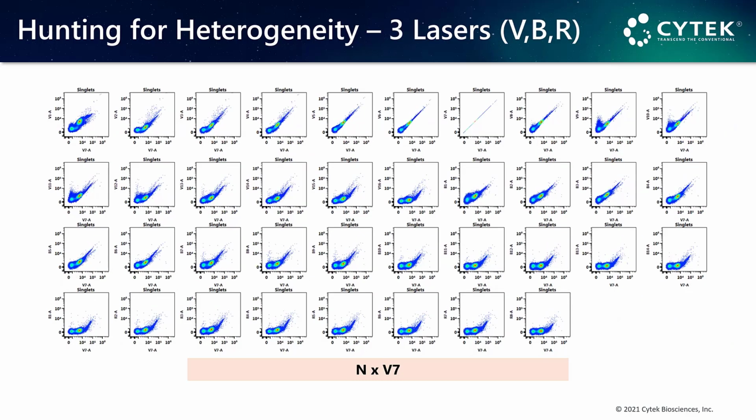And finally, when we are working with a 3-laser configuration, we still rely on the violet laser for providing us with informative separation of populations. In this mouse bone marrow sample, 2 very distinctive populations can be observed. This may not always be the case on a 3-laser system and will be dependent, as always, on your sample and your sample handling processes.